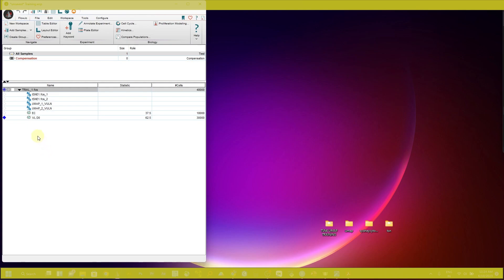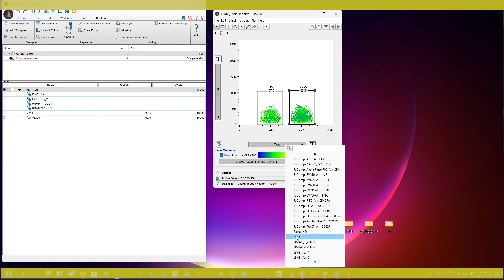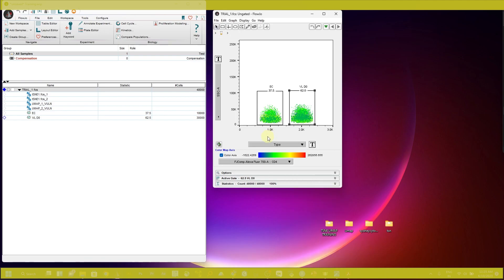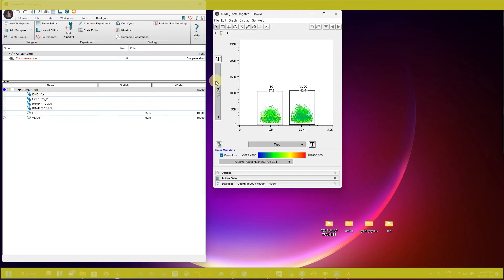Here I am showing my experiment in which I have two groups — EC and VLD0. I have concatenated all the FCS files and exported them as a trial FCS file. You can see I have grouped the concatenated file on the basis of keywords that I added — like the type of sample — before concatenating your data, so that you can differentiate your groups like EC and VLD0 in the concatenated file and run the t-SNE and UMAP.